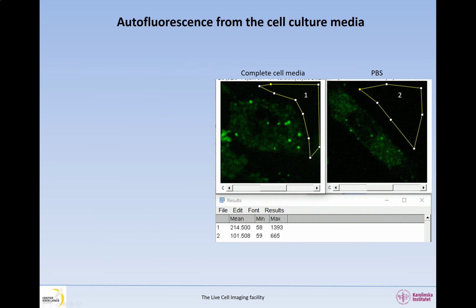When imaging live cells, one needs to cover them in cell culture media. Most cell culture media contain components that autofluoresce when excited, thus negatively impacting your signal to background ratio. If your signal is in the green channel and is dim, try replacing the normal culture medium with a culture medium without flavins, vitamin B12, and phenol red.